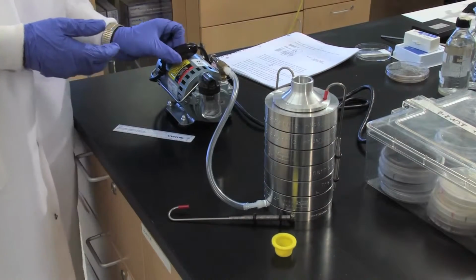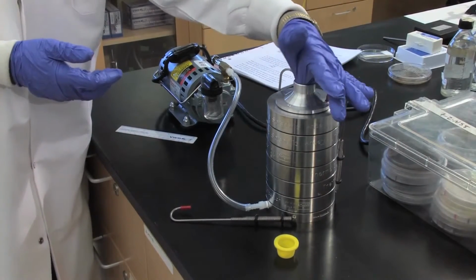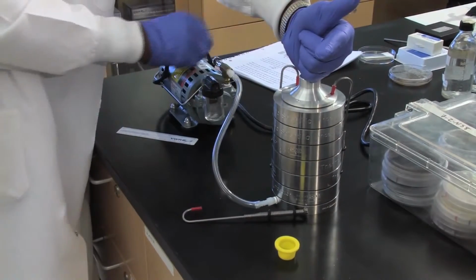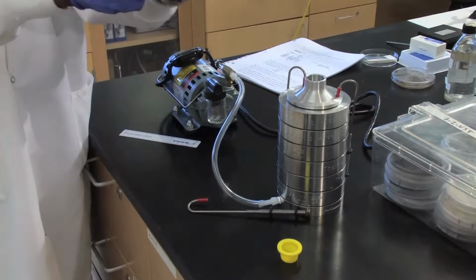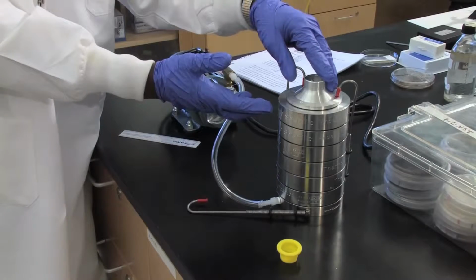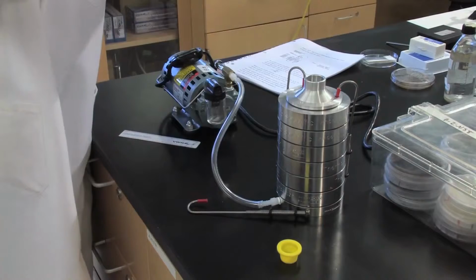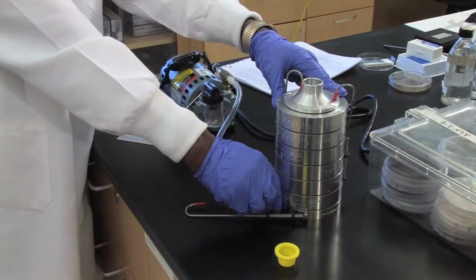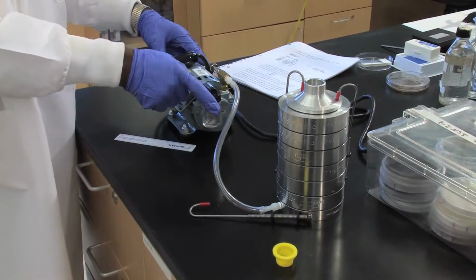So as we turn it on, okay, you can see how it's sticking in my glove. So that's pretty much how strong it would be. So that's to really demonstrate to you that air is being sucked into the system. So whatever is in the air is taken in, and then the air goes through a pump and then exits out of the pump.